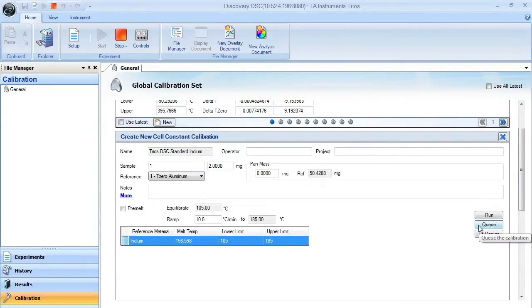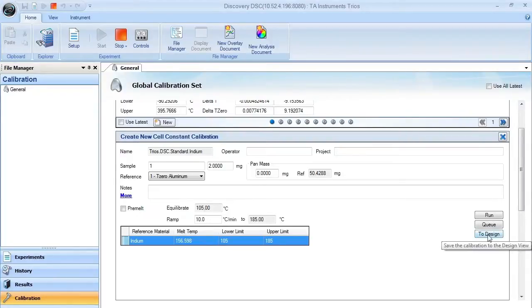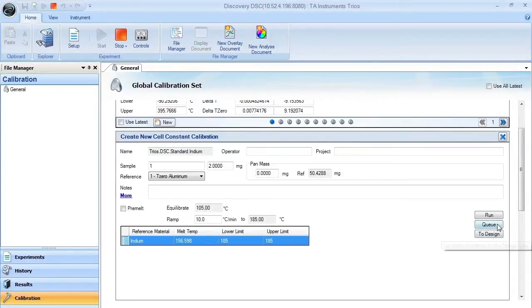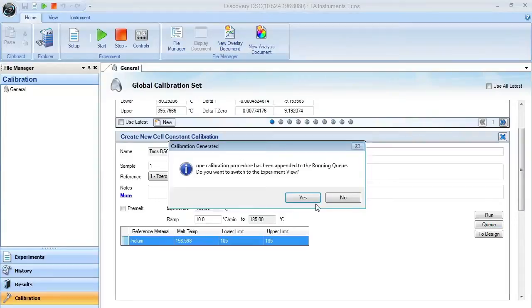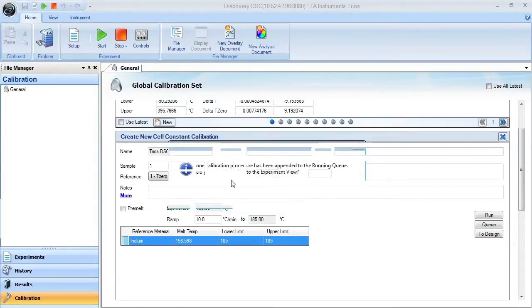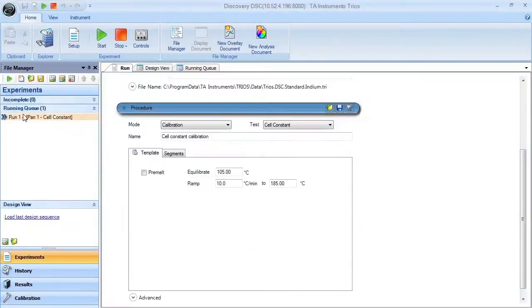You can throw it into the design view by clicking the to design button. In this case, we'll put that particular experiment into the running queue. Once you hit the button, it will prompt you that it's going to move to the running queue. Once there, it will allow you to run that experiment.